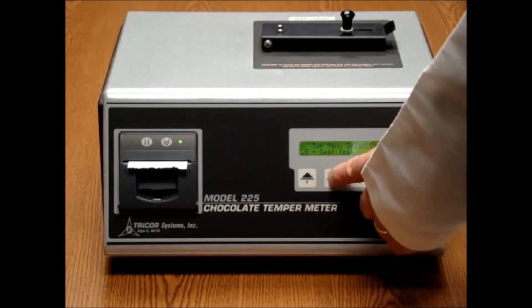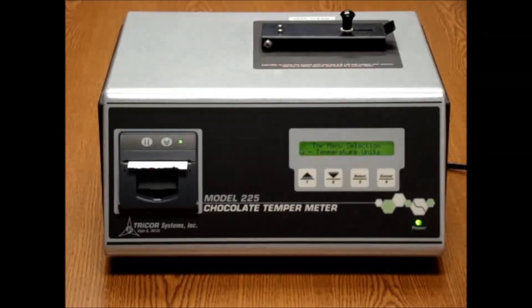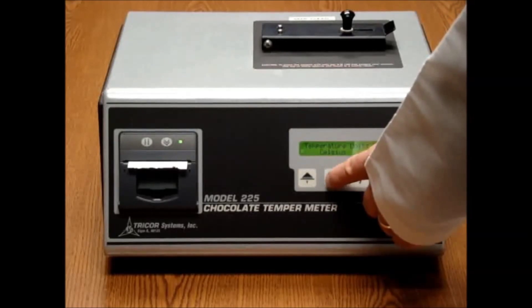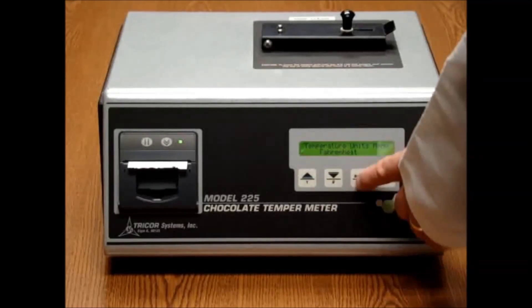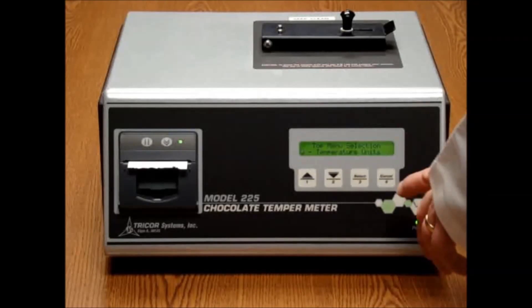You can also select whether you want Fahrenheit or Celsius by clicking through until you see temperature units. Click select again and by using the arrow buttons, you can toggle between Celsius and Fahrenheit. Hit select and that is entered into the system.